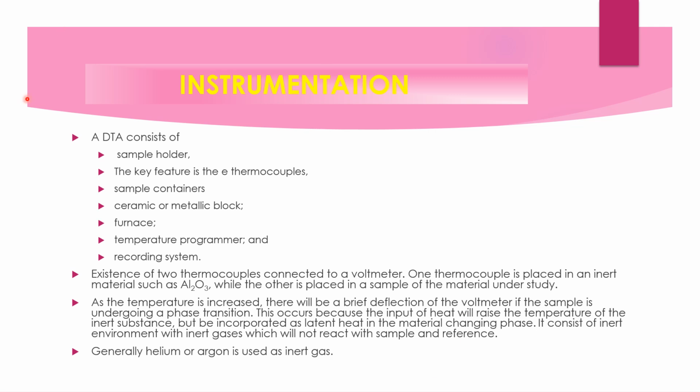So we will see it elaborately. The sample holder and thermocouples are the main things in this DTA. Next. And as I told you, the reference will mostly be alumina, and generally helium and argon inert gas is used in the system.